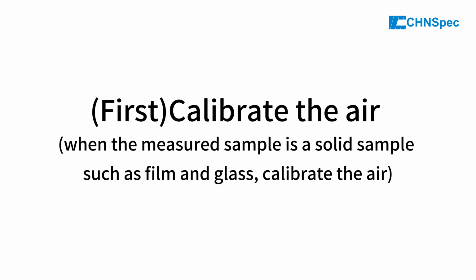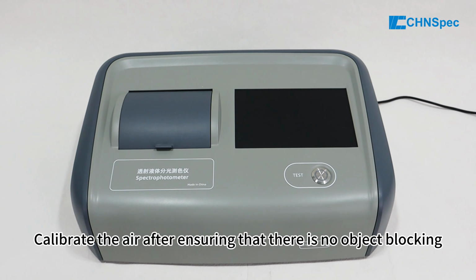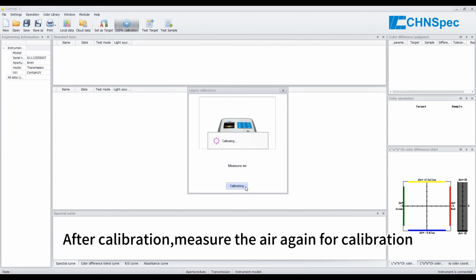First, calibrate the air. When the measured sample is a solid sample, such as film and glass, calibrate the air. Calibrate the air after ensuring that there is no object blocking the test port of the sample bin. After calibration, measure the air again for calibration.